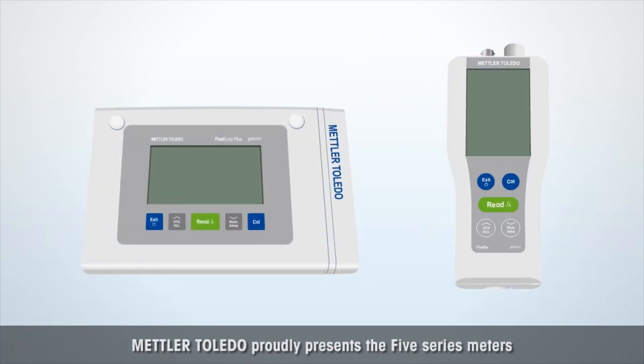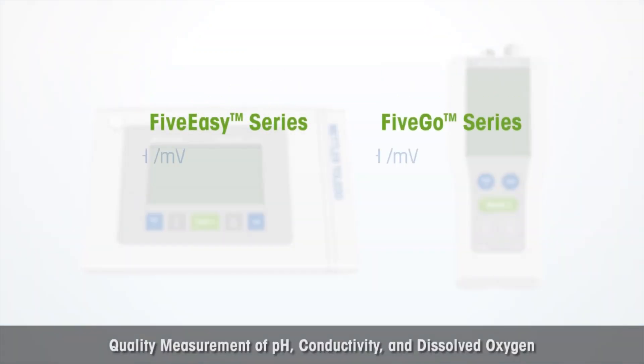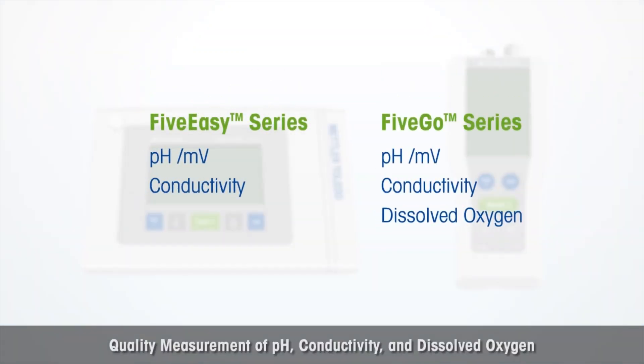Mettler Toledo proudly presents the Five Series meters — offering quality measurement of pH, conductivity, and dissolved oxygen.